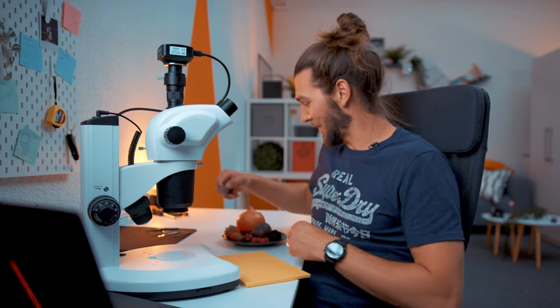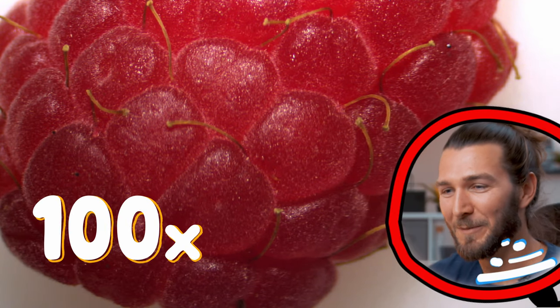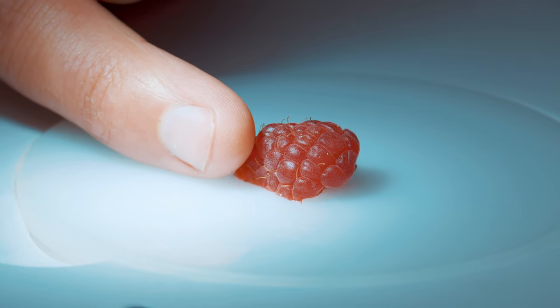Let's chop them up first. The raspberry — cut it in half. First we're going to look at it from the outside. Wow, cool, this looks so amazing up close! You can see here all these little whiskers standing out — you can see them by eye also. And over here, we got a raspberry seed, fresh and ready to plant.